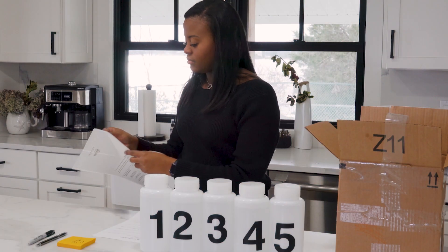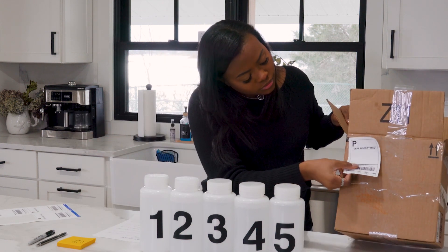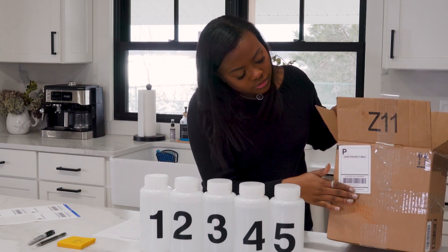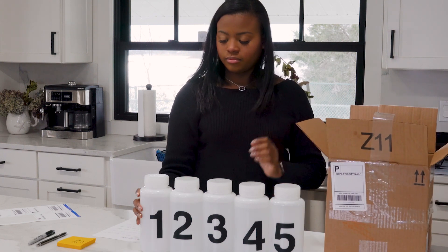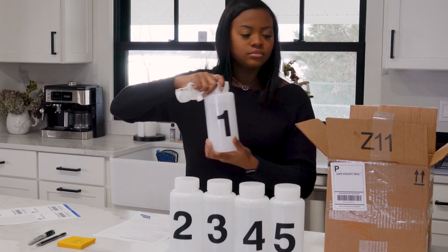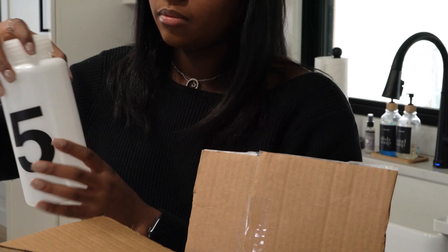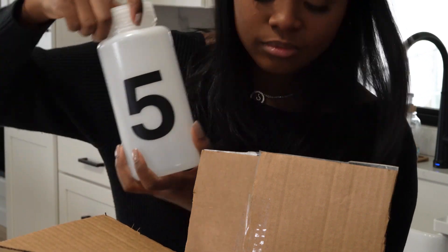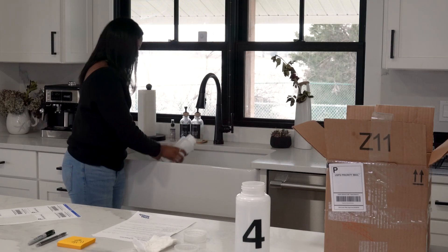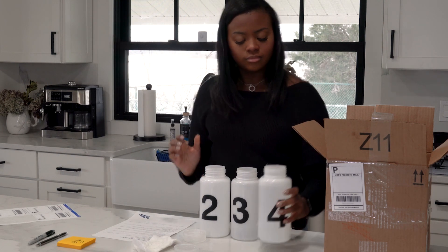If you are shipping the samples back, get the return box ready and make sure the return label is on the box properly. You only need to ship the full bottles labeled one and five back. Make sure that these bottles are sealed tightly before adding them to the box. Seal up the box with the samples and any other forms required. After everything is safely packaged, dump all the other remaining samples and dispose of these bottles as instructed.